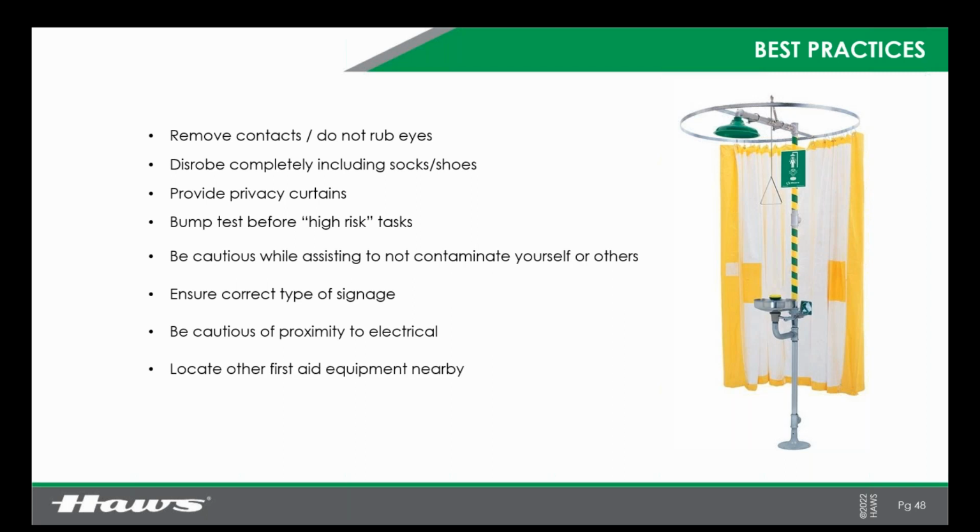Please. Locate other first aid equipment nearby. Make it a safety station. Put the first aid station kit over there. The defibrillator. Make this area ready for a first aid emergency. And then clean your equipment regularly, okay? So we don't get that buildup, we don't get nasty stuff in there. We're avoiding obstructions and things like that, okay?